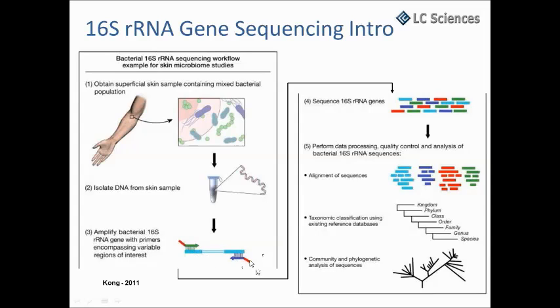And then with only one single PCR step, we capture the 16S V3 and V4 region, and then we sequence this after mixing multiple samples together. Based on the barcode, we do the demultiplexing and assign the reads to different samples, and then do the alignment of the sequence reads.